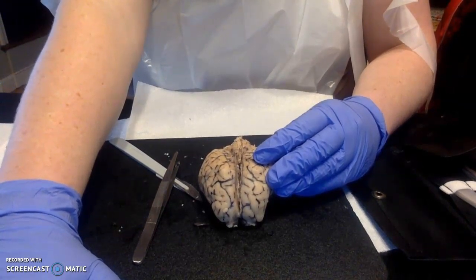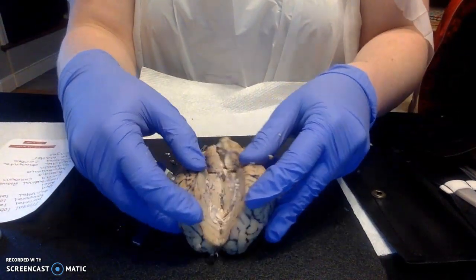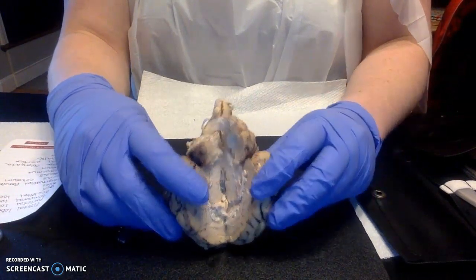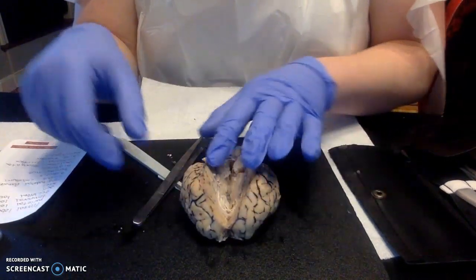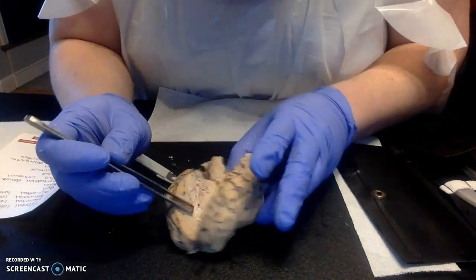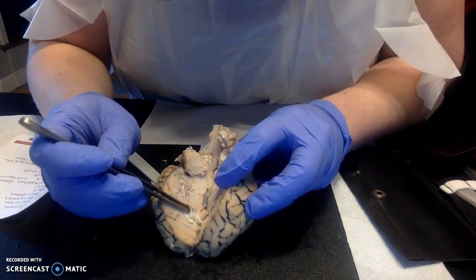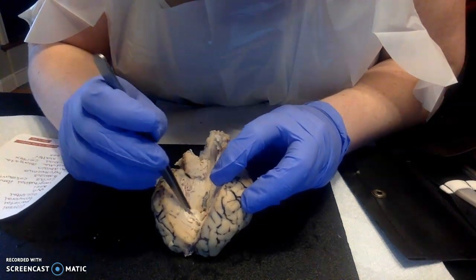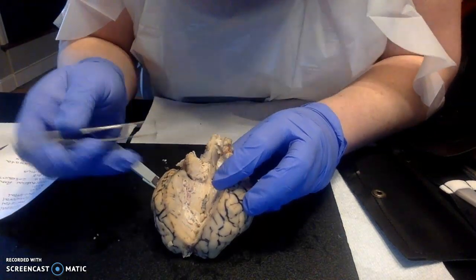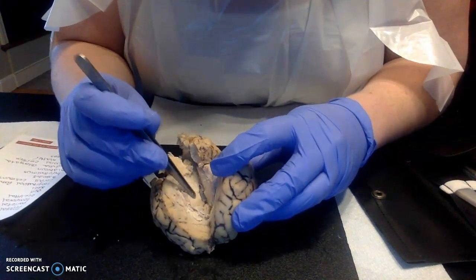I'm going to keep going down into where I had made the cut, and it split the sheep brain in half. So now I can tell you what's inside. So right here is the corpus callosum. It's this right here, if you can see it. And then the inside here, as well as the thalamus, this piece down here.